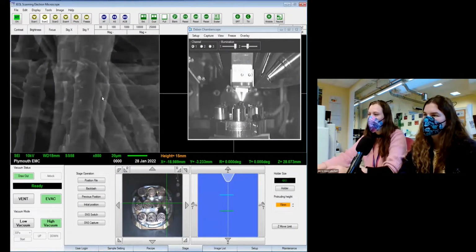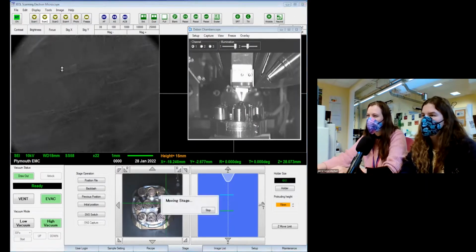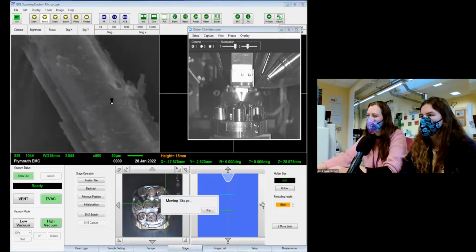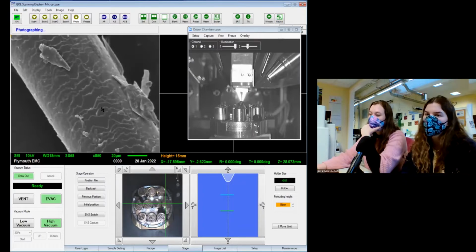Even the plates are quite smooth. I wonder if there's any bits where I've got the edge of a hair. Oh, that's quite coarse, it's a very long, coarse, smooth hair. Maybe rather than an outer coat or an inner coat thing, this is the other part of that. That's very different. The hair just kind of changed. On the top, it's a lot coarser, and then on his ears and his face and around his belly, it's a lot finer and softer. Maybe that's that coarse hair then. It's much wider as well.